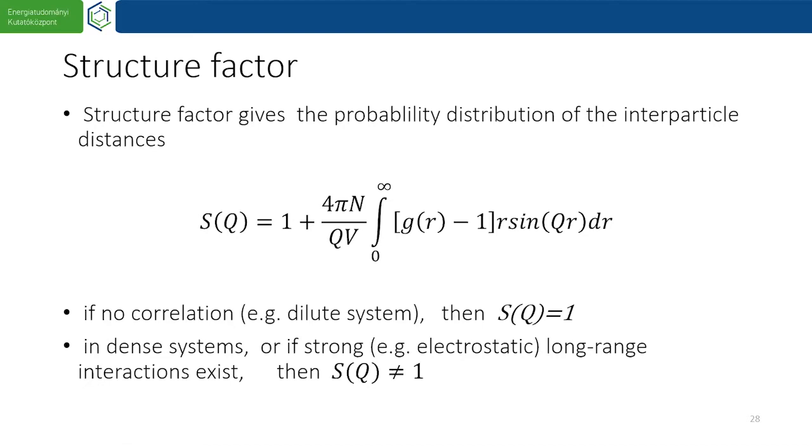Well, but I would say that there are very good ways to handle this problem. There are many decades of experience, so my statement is that they can be handled very well. The simplest thing is to make a dilution series. You prepare different concentrations and then you see the difference between them. And if you are accurate enough, then you can extrapolate to zero concentration. So if you can make such accurate experiments, then you can extrapolate the scattering curve to zero concentration.